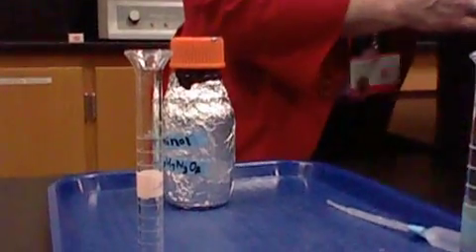Yes? Oh, okay. So this one would be a different chemical. This one's the same, but that one's different. All right, so what happened? The chemical reaction caused it to change colors, produce gas and produce light. But we don't know about temperature change yet. All right, well, let's find out.